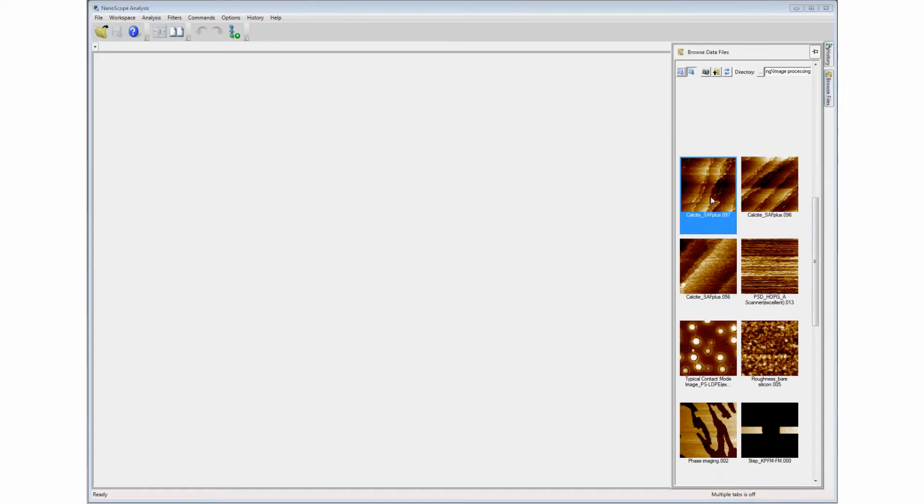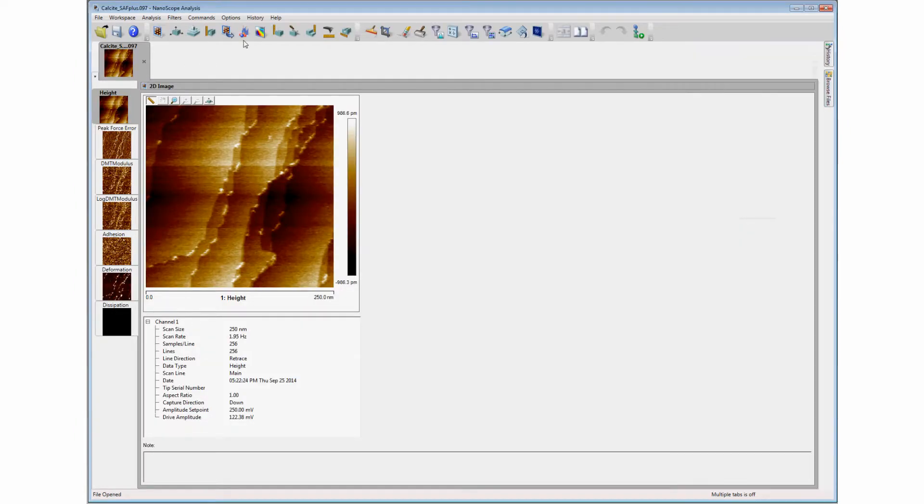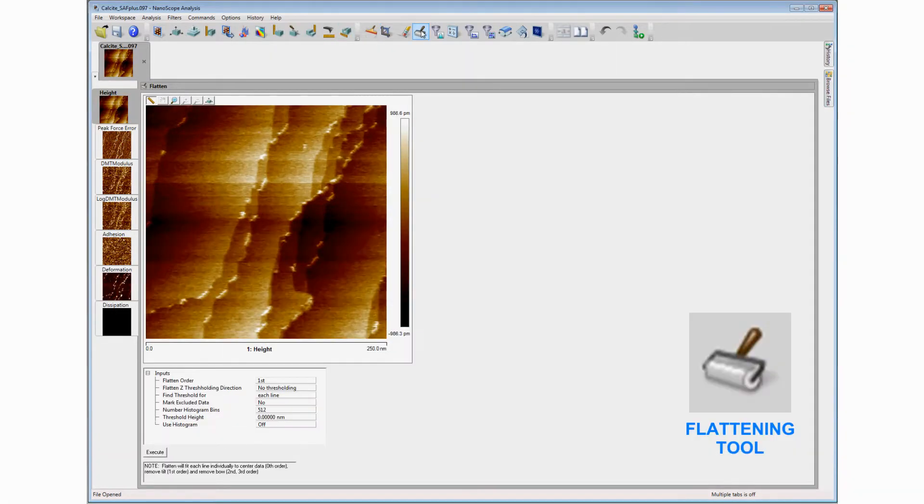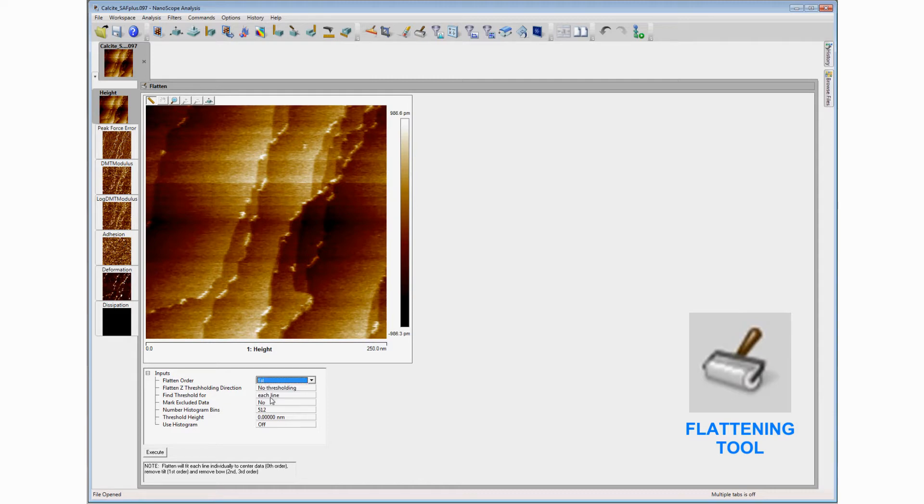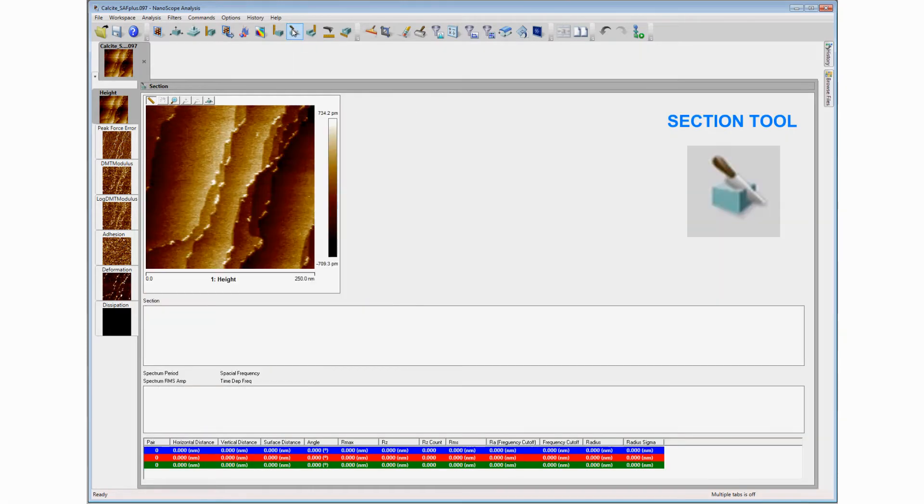Some image files may require flattening operations to remove scan artifacts that cause variations in the data from line to line or across the entire field. This is often useful before making measurements across regions or multiple lines in the topographic map.